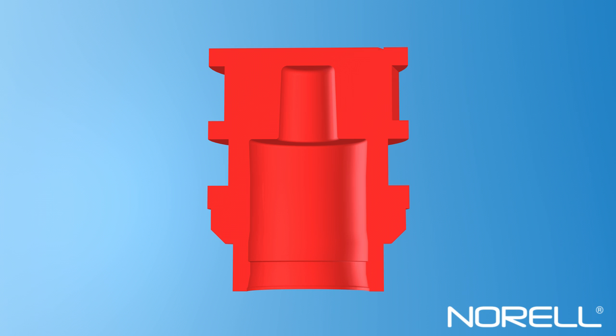The Norlock 2 Security Cap is applied in two stages. In Stage 1, for manual analysis using all spinner turbine-based NMR spectrometers, simply align the specially enlarged cap opening with the NMR tube and lightly push the cap to the natural stop formed by the security band. The ensuing placement and single-stage seal is a novel progression in lab safety with enhanced performance and ergonomic feel.